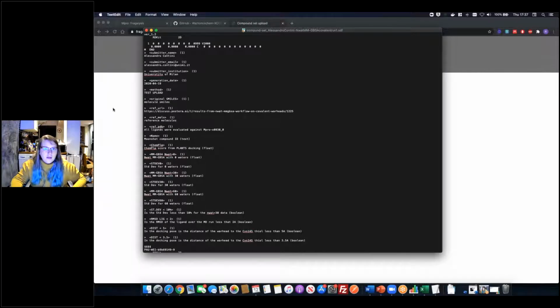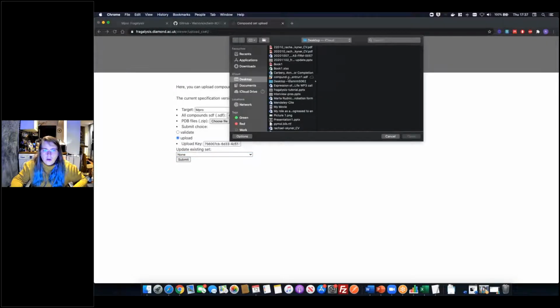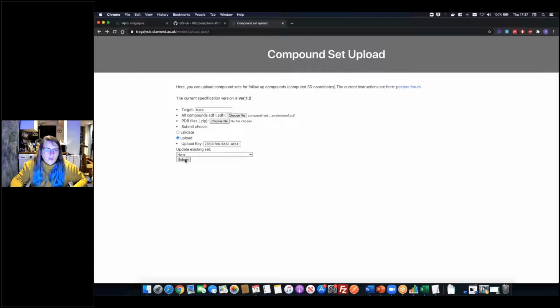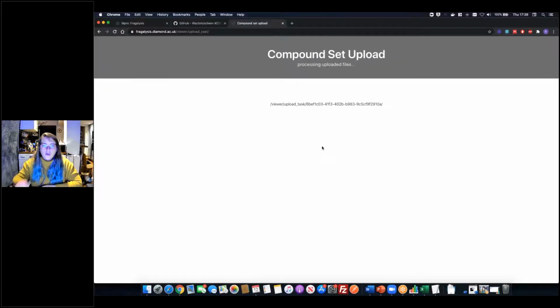So I'll save that and then give it another go. And we might have more luck this time, or we might not.